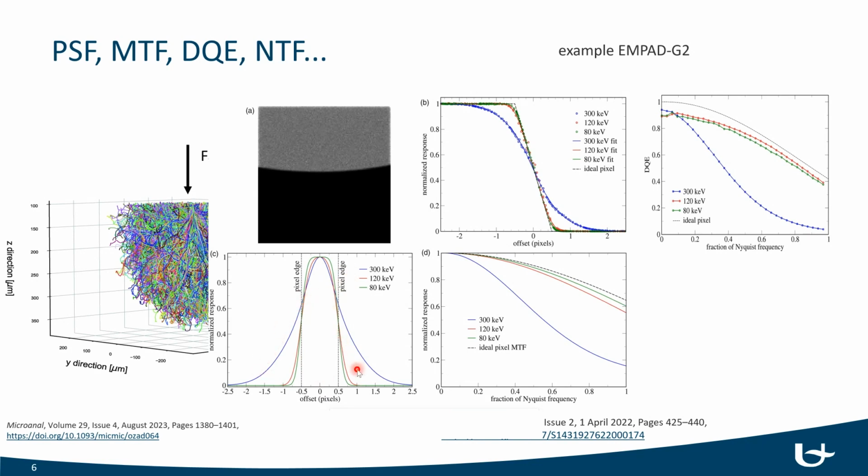There are ways to work with this because when a single electron hits, in such cameras, you will get multiple hits. So this is a hybrid pixel camera also. And if they all happen at the same time, you can use this to do so-called declustering, because you know that all these hits belong together, and you can work back to the center of mass of this event, and then you have tricks to really sharpen this up and to correct what looks like a downside here at 300 kV, turn it into your advantage and actually get very good response also. But you need this correction step then.